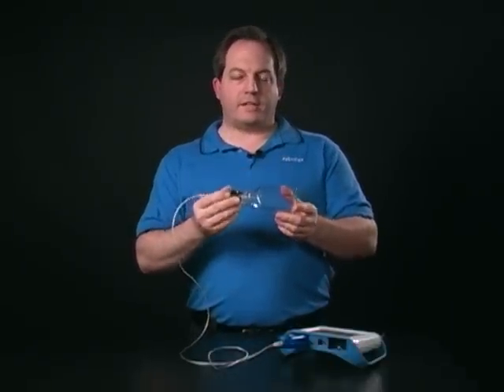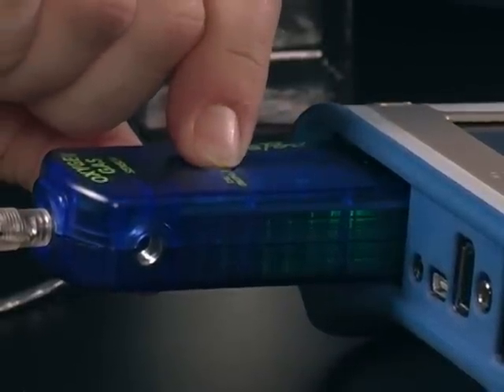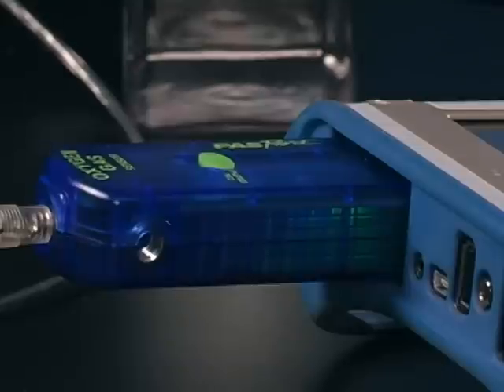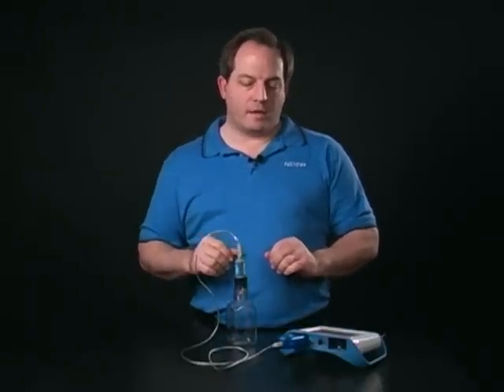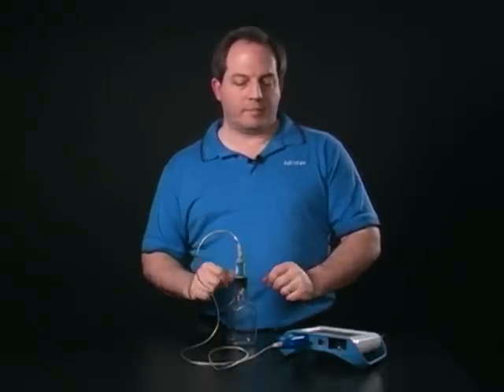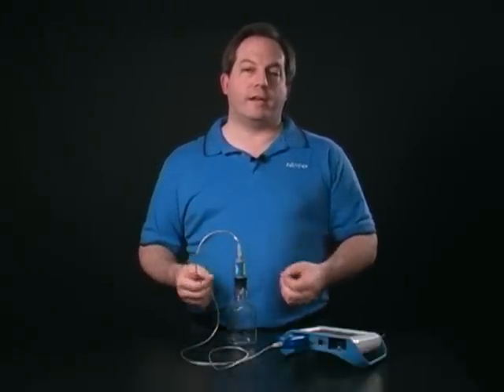Now that we have it connected, I'm going to go ahead and press my calibrate button, and this is going to set the value that it's reading right now in the bottle to 20.9. It is normally solid, but while it's going through its calibration process it is blinking, and it'll go on for anywhere from 30 seconds to a minute as it's getting a good average of the air that it's seeing inside the bottle. Once it has finished blinking, it'll go back to solid to let me know that it's finished calibrating and it's ready to use.